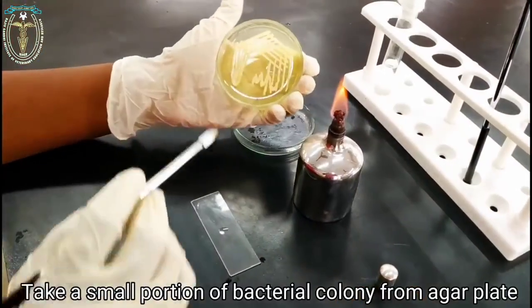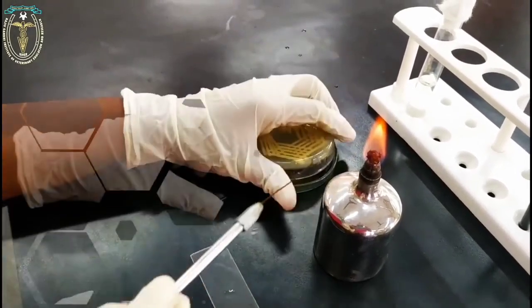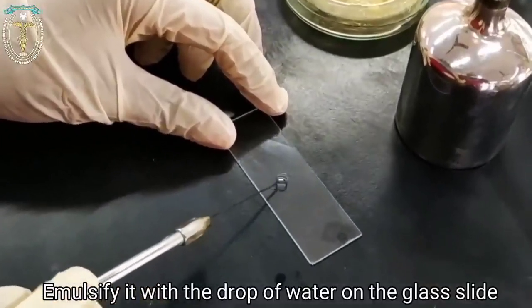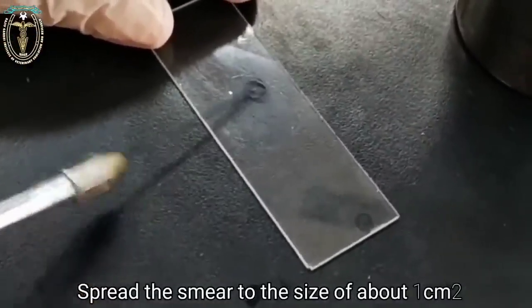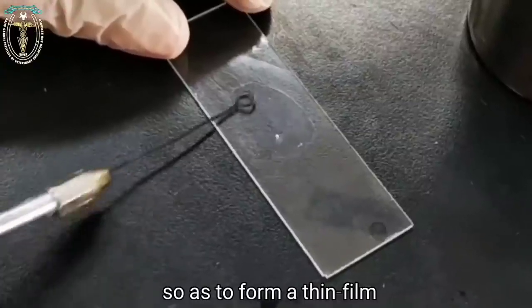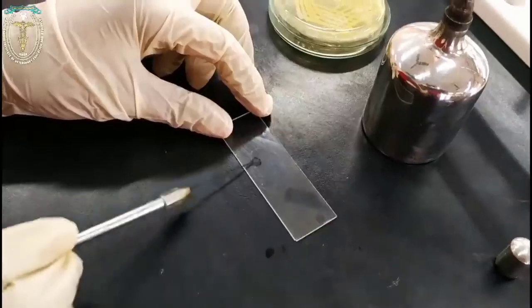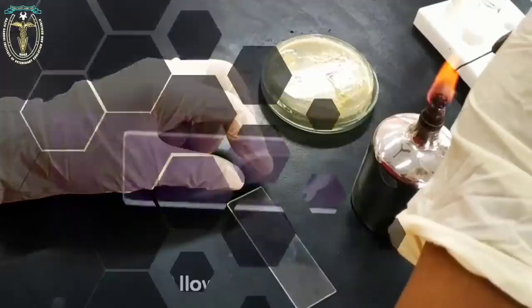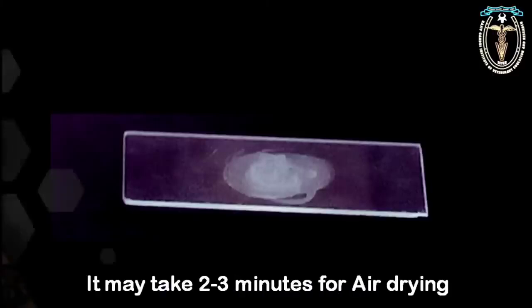Take a small portion of the bacterial colony from the bacterial culture plate and emulsify it with the drop of water on the glass slide. After emulsifying, spread the smear to the size of about 1 centimeter square, so as to form a thin film. After spreading, allow it to air dry. It may take 2 to 3 minutes for drying.